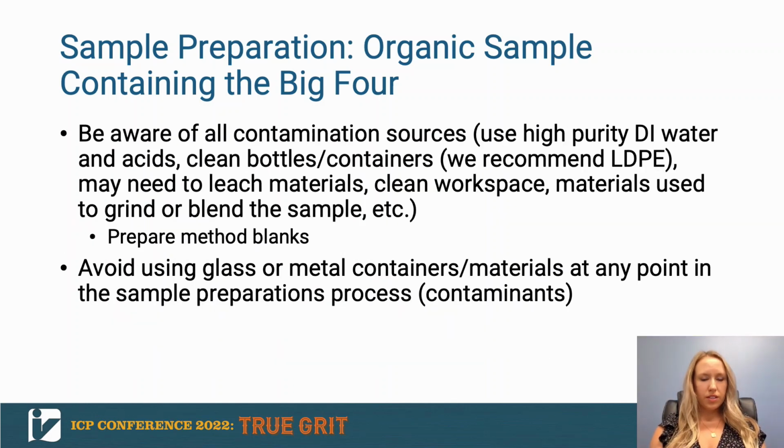Another thing to be aware of in your sample preparation is any source of contamination. So make sure that you're using clean sources of reagents, your acids, your container types, bottle types, the materials that you're using for your aliquots, anything you're using in the processing or homogenization of the samples. So again, preparation of method blanks is really going to help you determine whether any contamination is being introduced during your sample preparation.